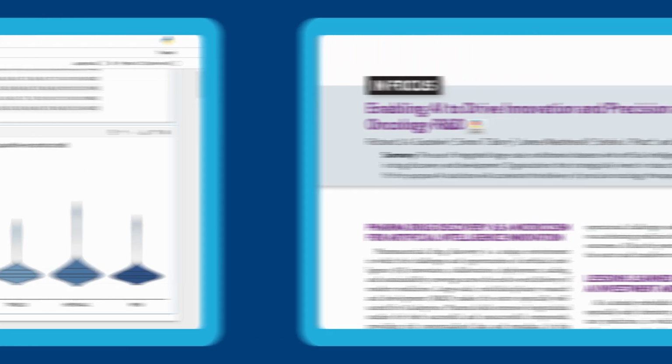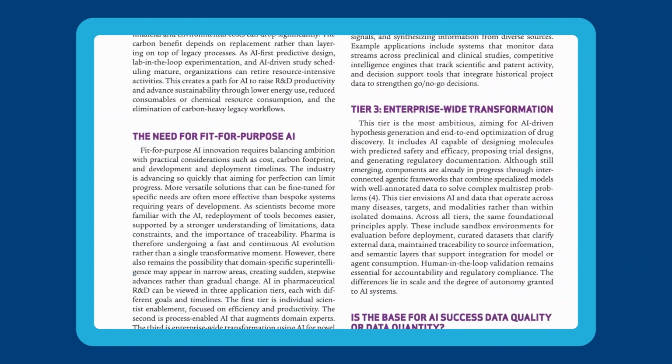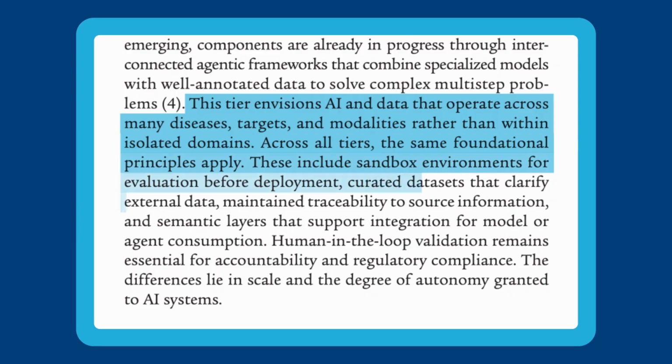the data is governed. A recent paper from AstraZeneca identifies a critical missing piece in the field, a trustworthy layer that AI agents can actually reason over. ODM is that layer. A published schema, an MCP server, composable agent skills, and versioned data templates turn a governed registry into something agents can query, interpret, and act on.